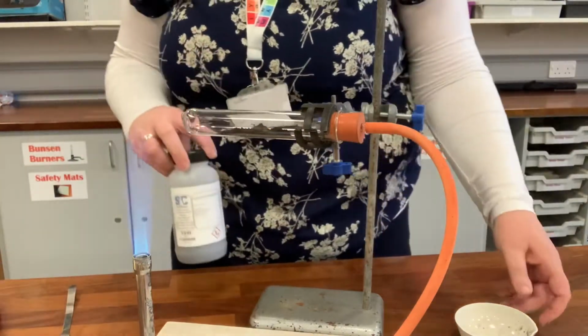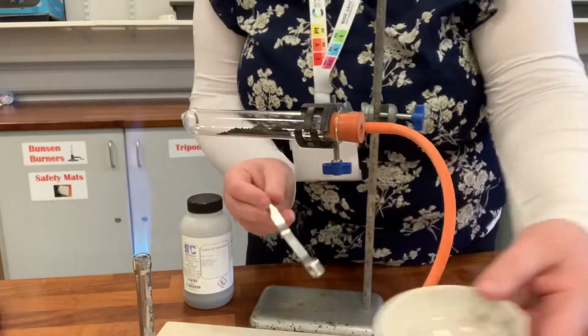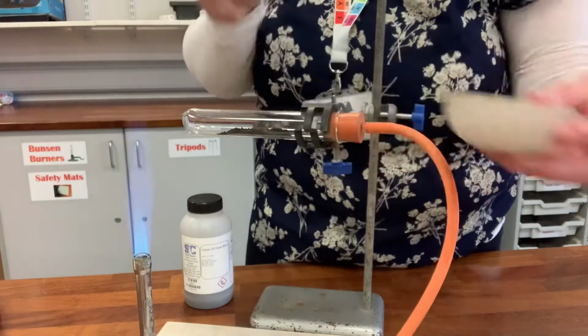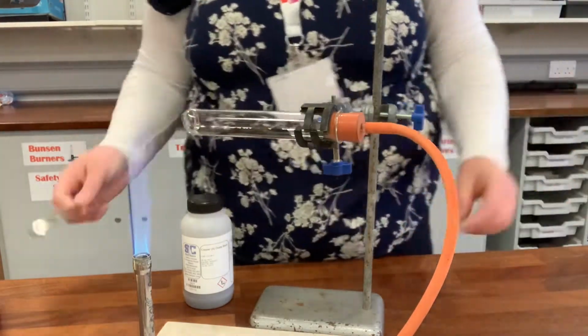It's copper oxide. It is a black powder. I've put some just into an evaporating basin here for you to have a look at. So it's a quite fine black powder. Now, I've got a layer of it spread out along this tube. This is called a combustion tube.